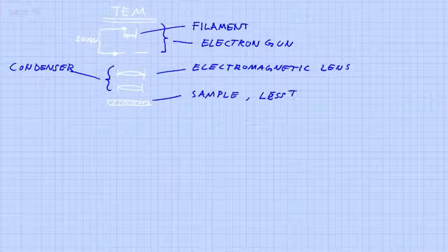Here we put in the sample, and the one drawback with transmission electron microscopy is that the sample needs to be transparent to electrons. That usually means that the sample must be less than 200 nanometer in thickness. And 200 nanometer, that's very tough to grind down, so you usually need to take some other techniques into account. Electropolishing, ultramicrotoming, or something else.